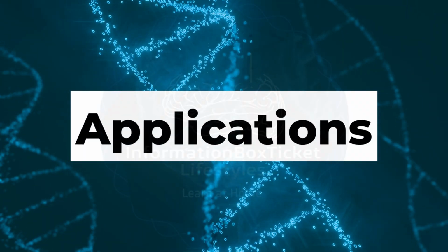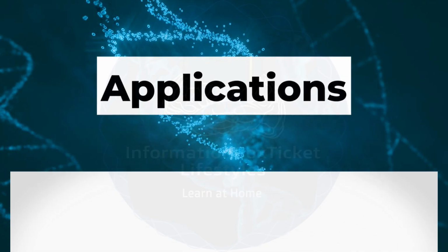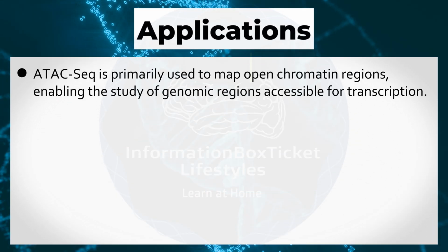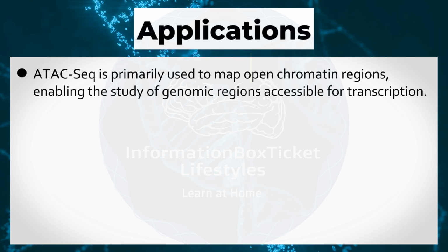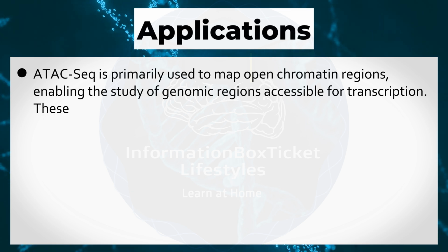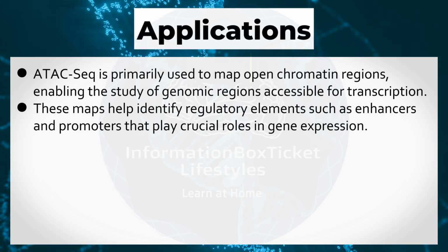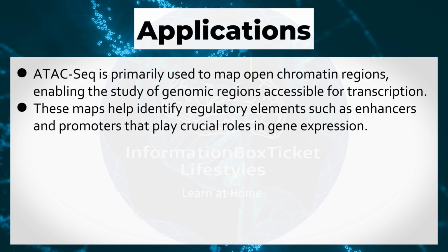Applications of ATAC-Seq. ATAC-Seq is primarily used to map open chromatin regions, enabling the study of genomic regions accessible for transcription. These maps help identify regulatory elements such as enhancers and promoters that play crucial roles in gene expression.